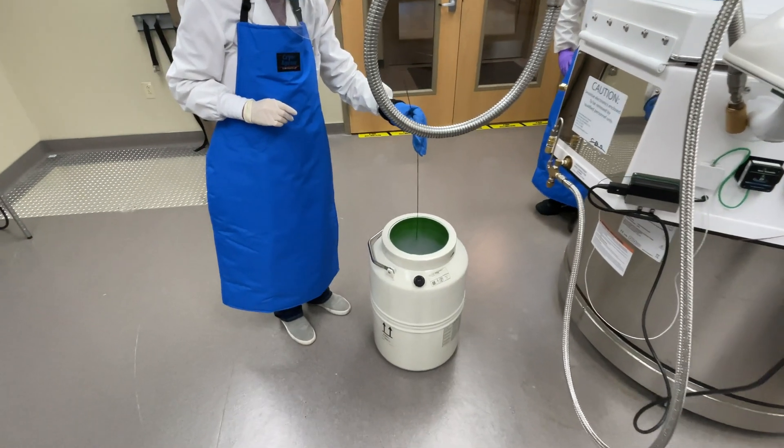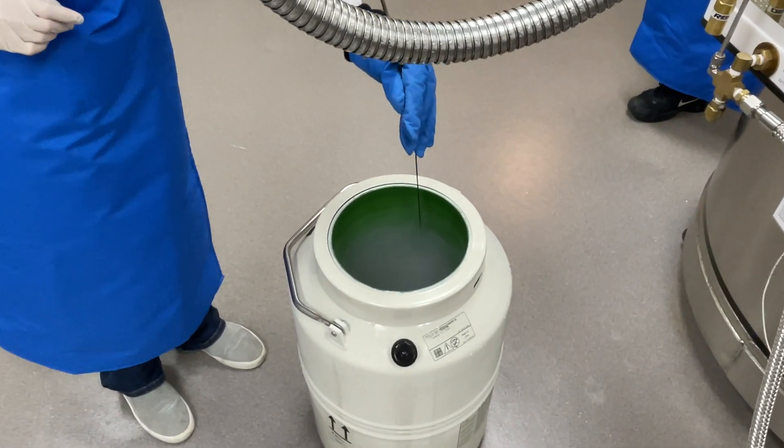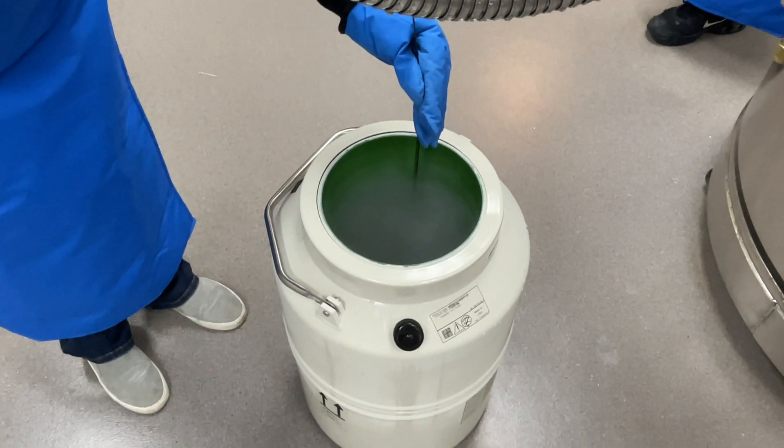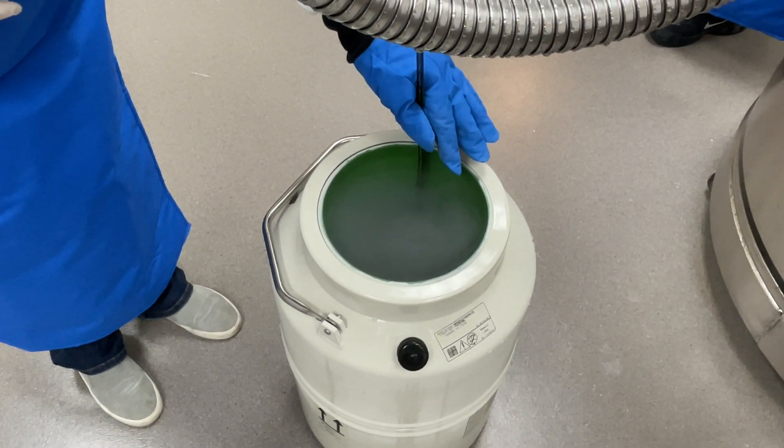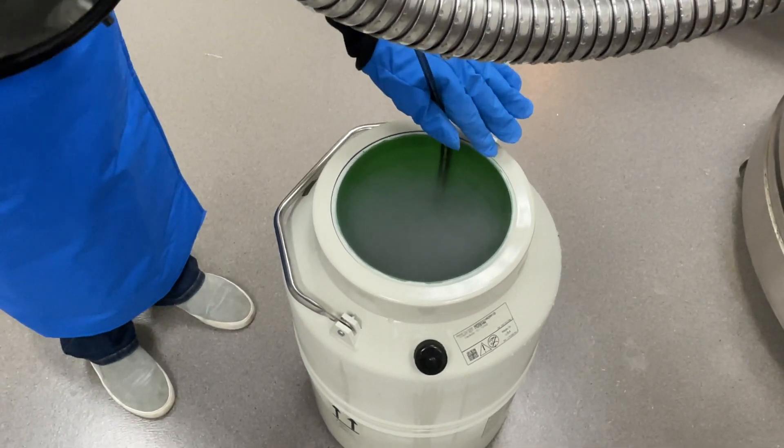You may have difficulty seeing the liquid level due to the vapor. You can use a cryogenic ruler to displace the vapor. Place it slowly into the liquid nitrogen, as it may cause boiling to occur due to the temperature difference.